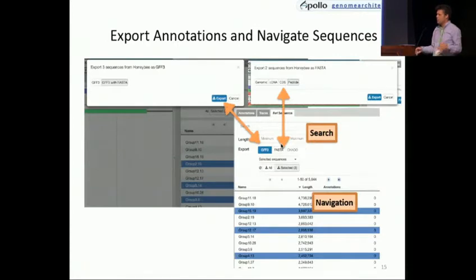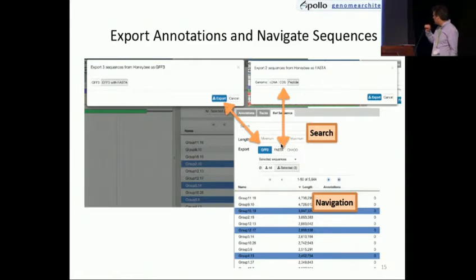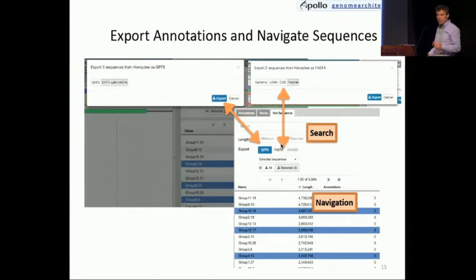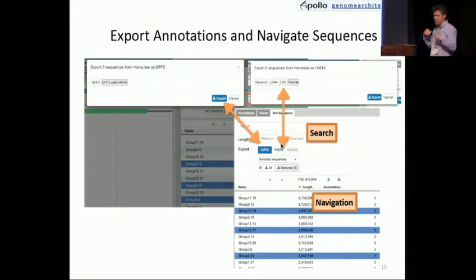We can also view scaffolds and quickly navigate through them. The important part is you can export these out as GFF3 or FASTA. We talked earlier about Chado — if you have a Chado database, you could do a Chado export and automatically that database would be populated.